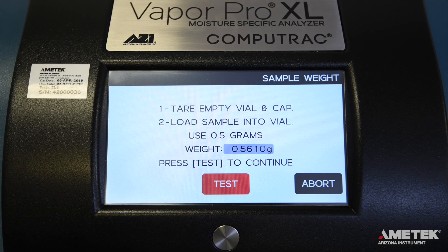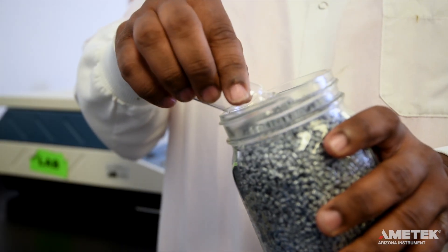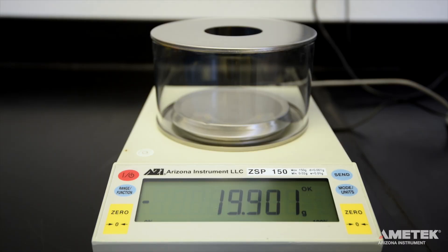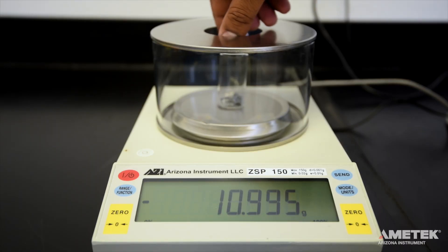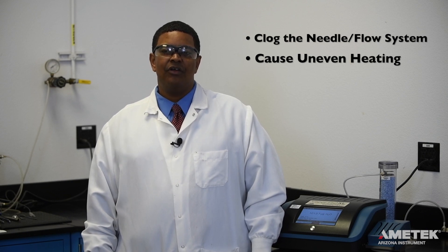Press test on the main screen and follow the instructions to perform the test. Add the appropriate amount of sample to the bottle, then cap and weigh it. Do not overfill the sample vials. Doing so can cause a number of problems, such as clogging the needle or flow system, causing the sample to heat unevenly, or dramatically extending the test times.